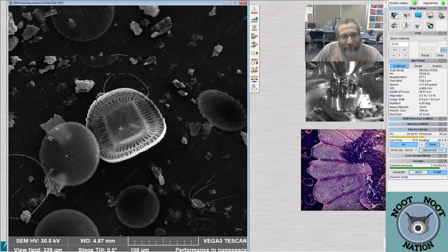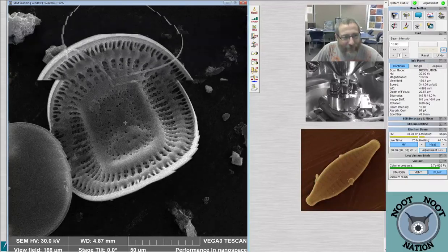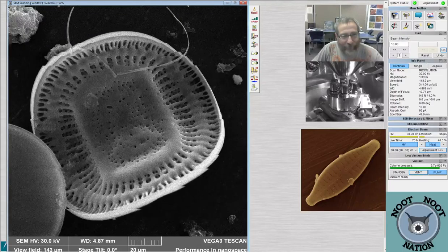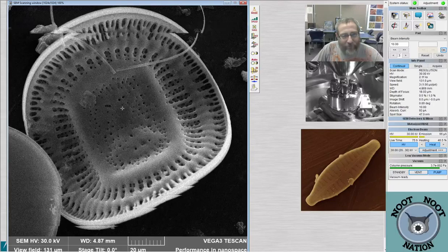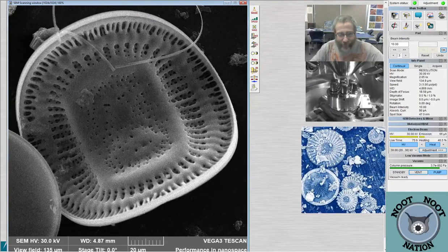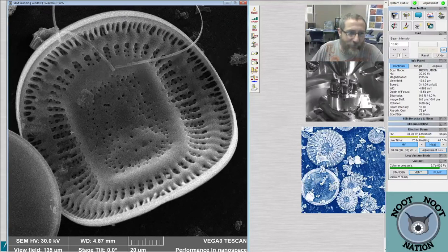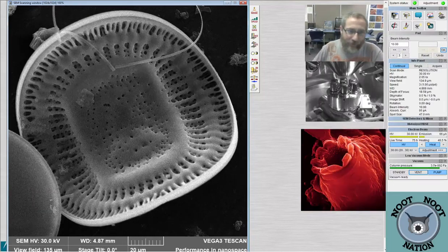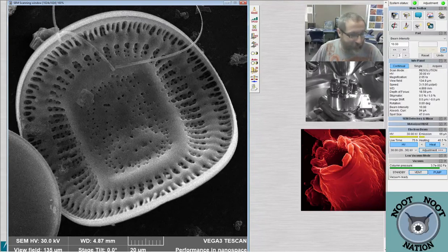This cool diatom is Campylodiscus, and I'm very excited to see this Campylodiscus. This one's kind of square looking in the SEM, but it's in fact shaped like a Pringle. It looks like it's out of focus up here and down here, and that's because those things have topography coming at us, and so it's curled, right? Like a Pringle chip, it's saddle shaped. And this is a really cool diatom.